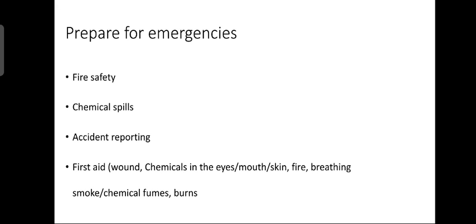Students should understand that the purpose of reporting and documenting accident is not to affix blame, but instead we should find the cause of the incident so that similar incidents may be prevented in the future.